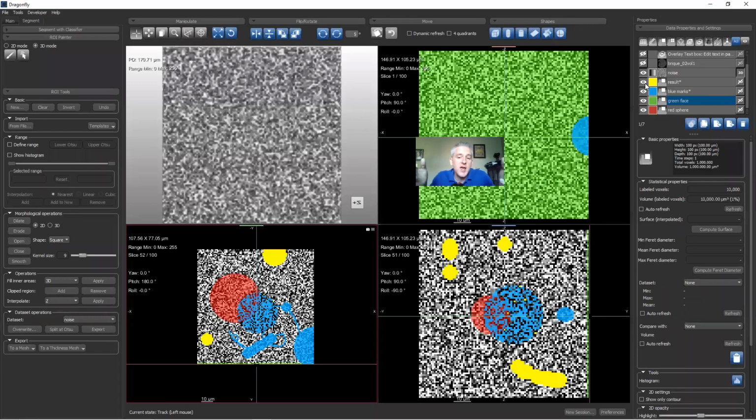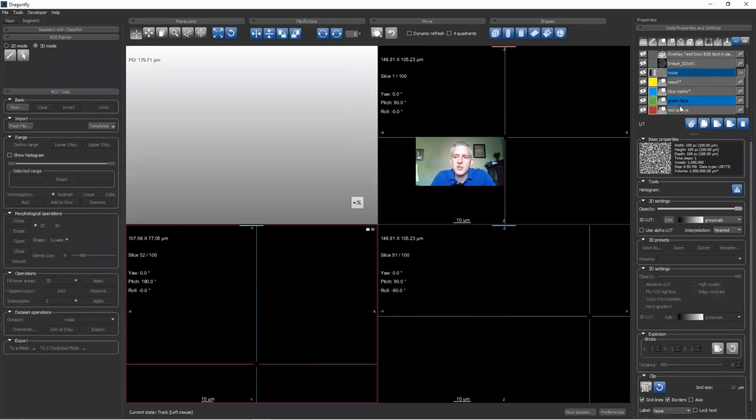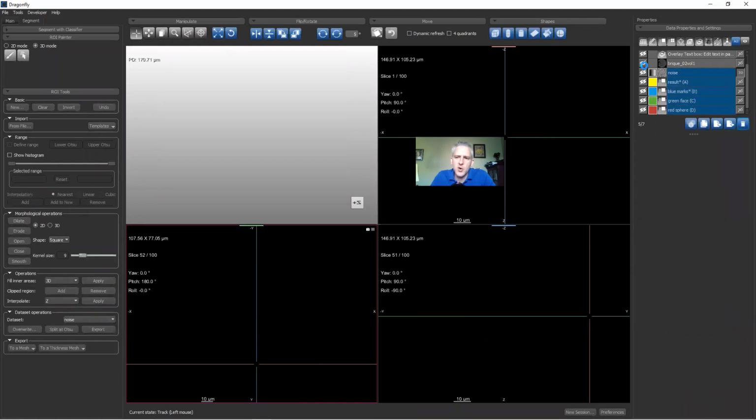So we're going to look today at differentiating pores that are accessible and pores that are inaccessible on a real data set, and we'll use that. So those are all the elementary operations that I want to show today. I can actually delete all of these and we can turn our attention to the brick.